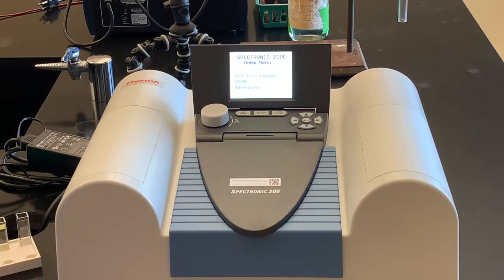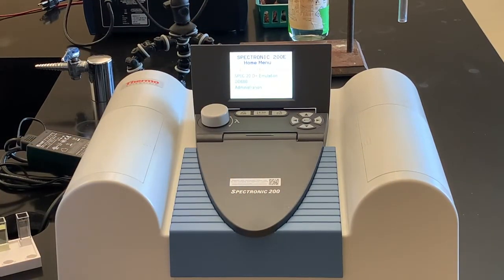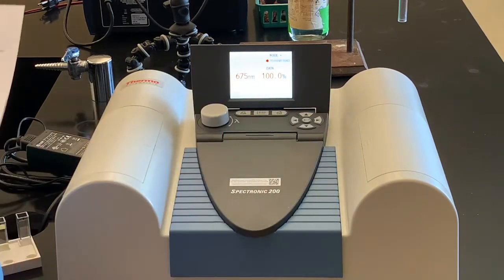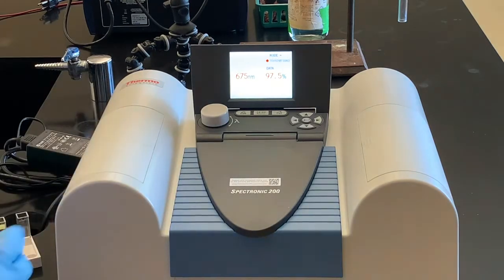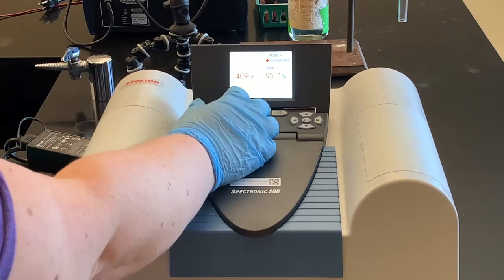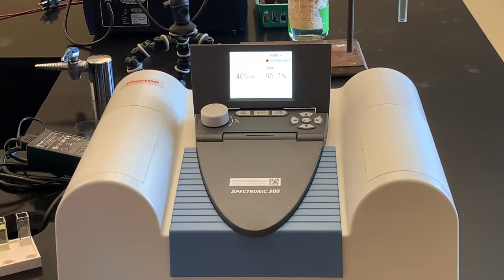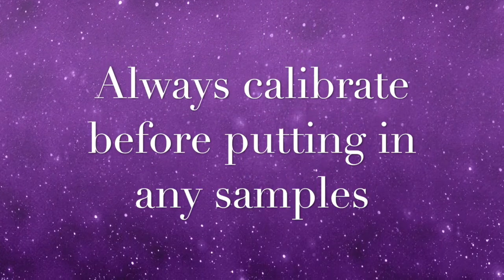I've already turned it on and it's already gone through the initializing steps. I made sure this compartment is empty — this is where our cuvette is going to go. We're using the Spec 20 feature, so I'm going to scroll down to Spec 20 and select that. Then I want to select our wavelength, adjusting it to 405 nanometers with this little knob. If you turn the knob it changes by about 10 nanometers at a time, but if you press down and turn it changes by one nanometer at a time. Now I'm at 405 nanometers.